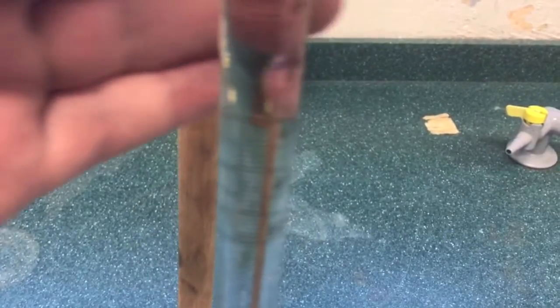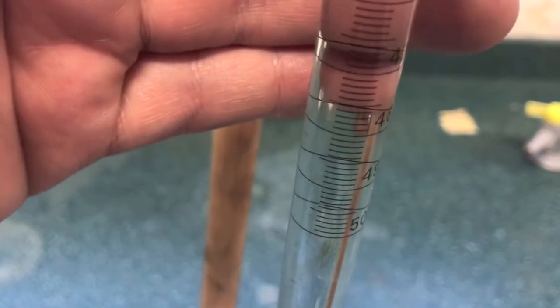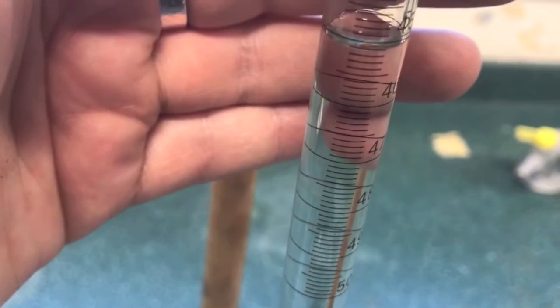This procedure is repeated as necessary until two results are obtained that are concordant. This means that the added volumes are within 0.2 ml of each other. For example, 20.1 and 19.9 would be concordant.